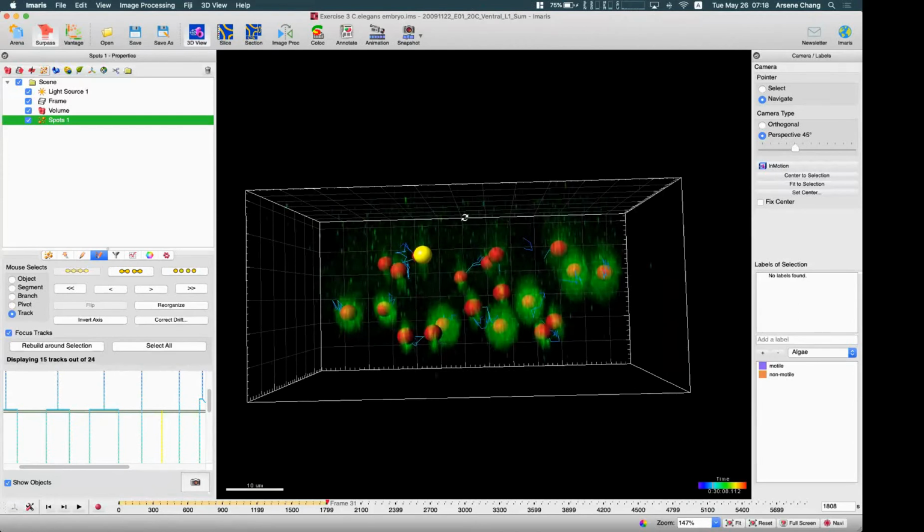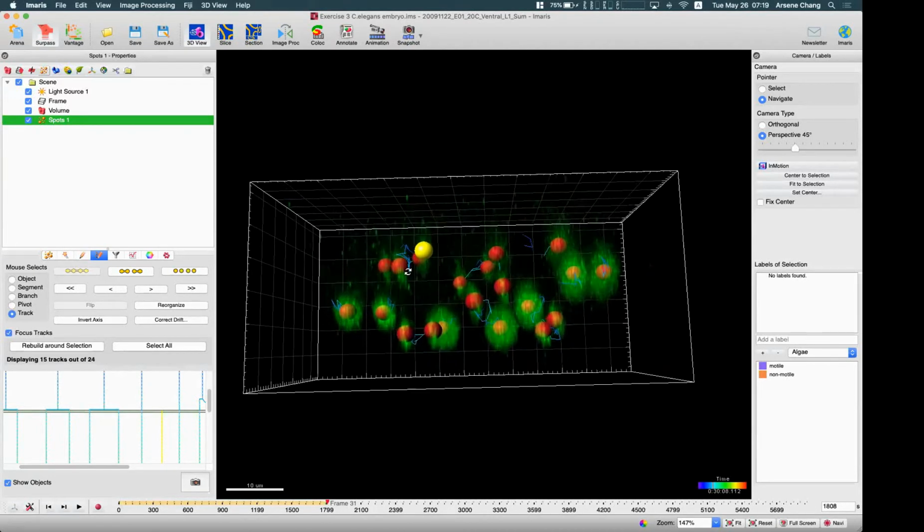Yes. In the batch processing, maybe we will mention it in future sessions, but we have a function called batch, which can run the algorithm for multiple images at the same time. And since 9.3, we have this new batch pipeline.